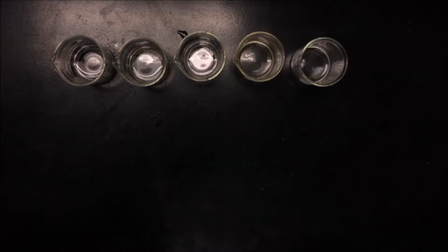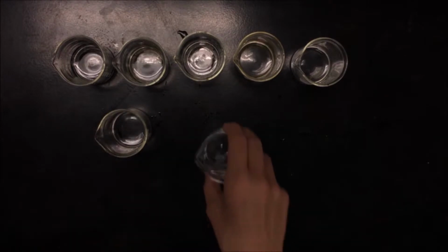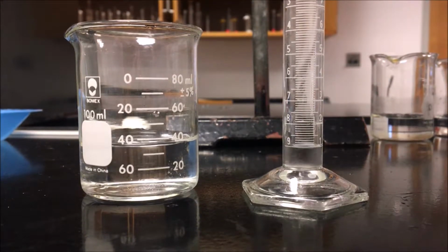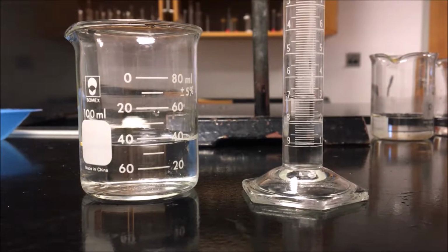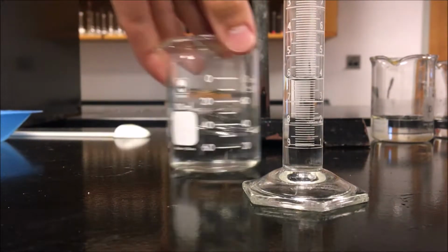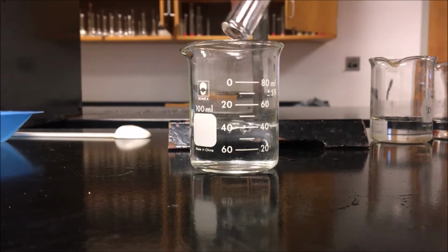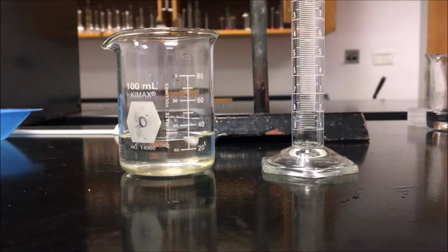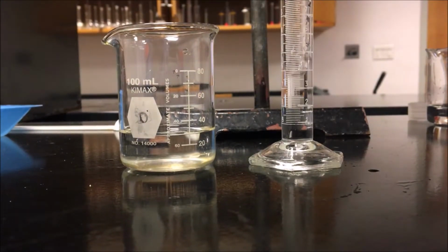Line up all your beakers from most water to least water and get ready to add lead-2 nitrate. For the first beaker, add 4 milliliters. For the second, add 6 milliliters.